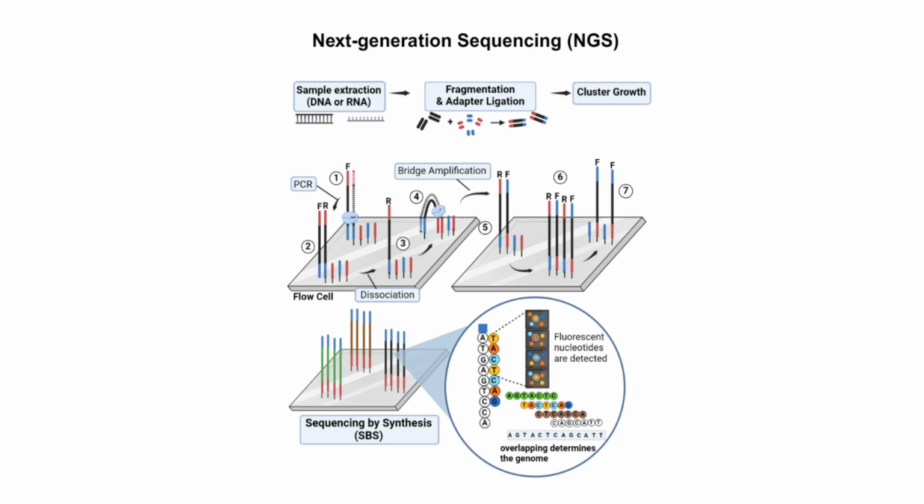Next Generation Sequencing (NGS) has revolutionized DNA analysis by enabling the rapid and affordable parallel sequencing of millions of DNA fragments. Several core technologies drive this field.